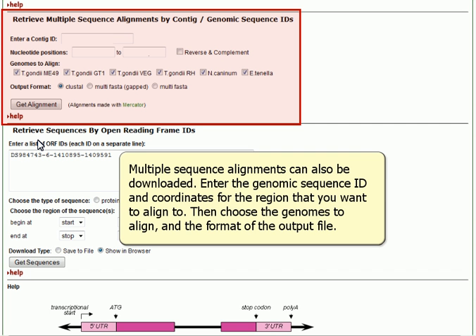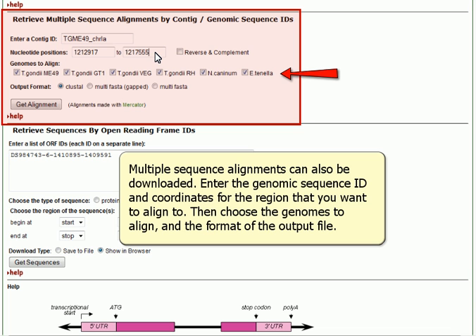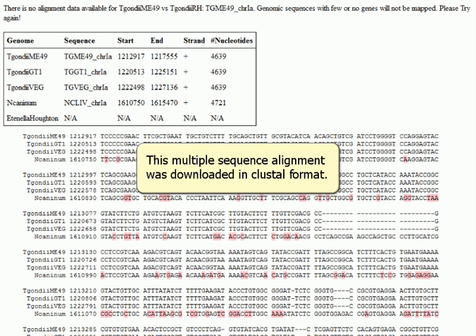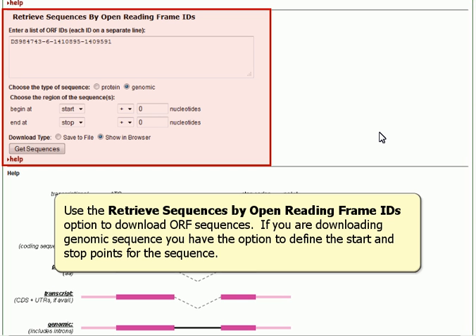Multiple sequence alignments can also be downloaded. Enter the Genomic Sequence ID and coordinates for the region that you want to align to, then choose the genomes to align and the format for the output file. This multiple sequence alignment was downloaded in Clustal format.